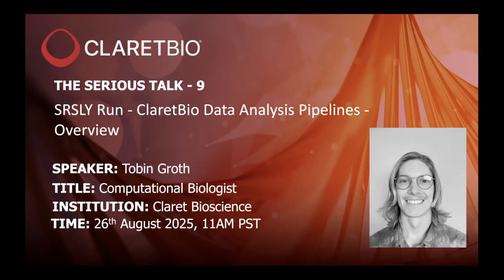If you're joining for the first time, we at Claret have a webinar series called Serious Talk, where we showcase work by the users of Claret Bio products and also some internal presentations where folks at Claret showcase new products, new technology, pipelines, and so on.